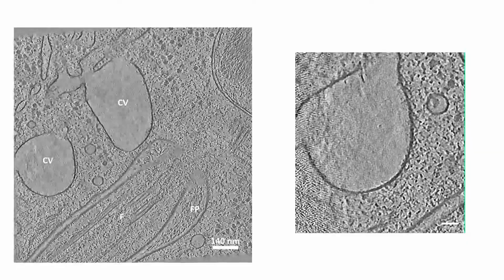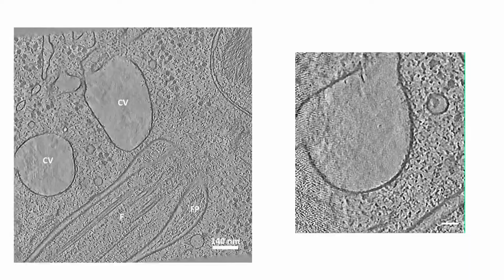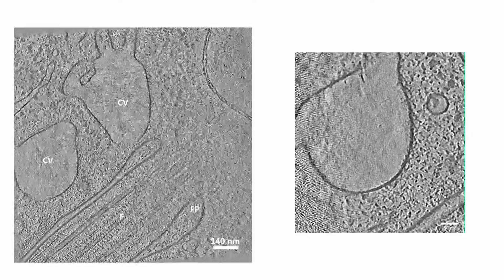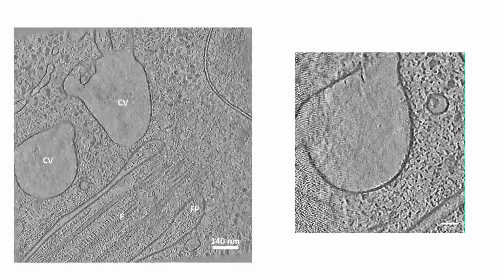that Matthias showed you yesterday. So he made some subtomogram averaging, and we are working on that. But it reminds me a lot of the retromer complex. So it's a very particular complex. It has a well-established structure, and this reminds me a lot of that.